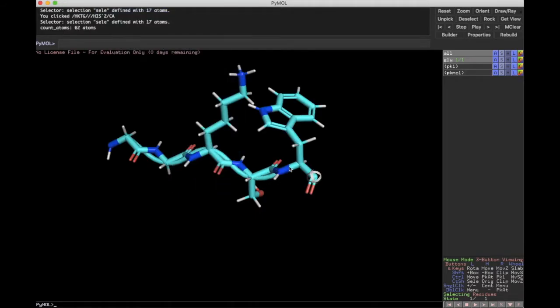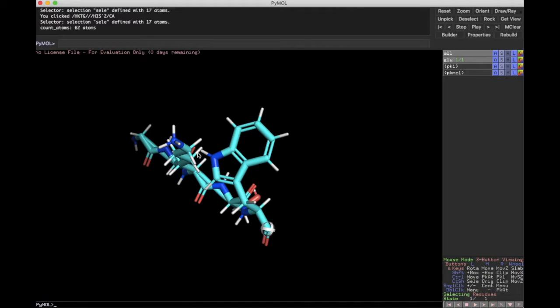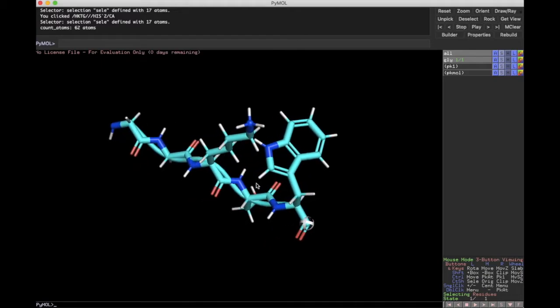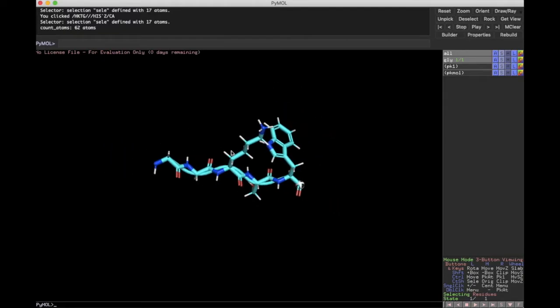Boom, all right? So you can see that this is where the terminus was, again, where the amino acid chain extended through a carbon-nitrogen bond. And then now, again, we have the C-terminus, which is over here. But one thing you'll see is like, wow, these amino acids are very close to one another. So that's probably not real. We'll need to do some sculpting to this, okay?